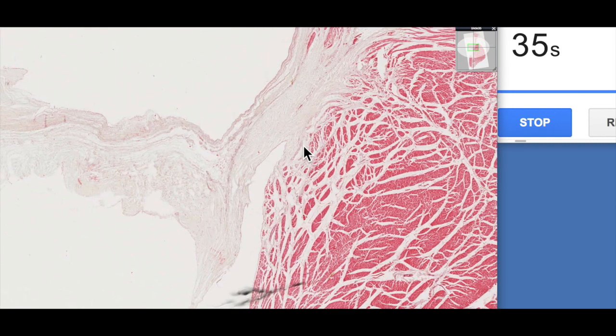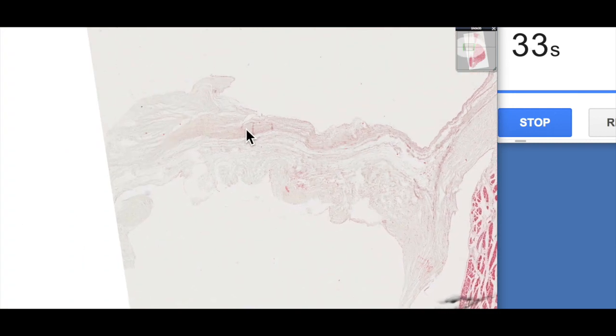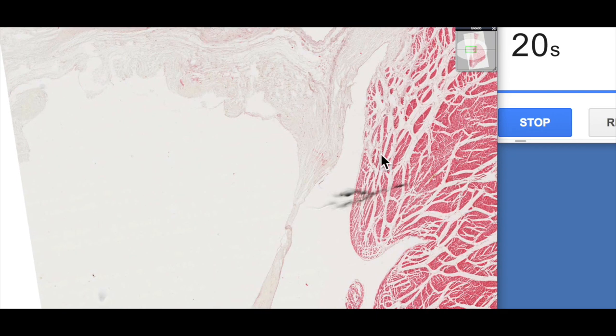So here again, as we mentioned, this is the atrioventricular valve. You can kind of think of it as an endocardial sandwich with the endocardium on this side, endocardium on the ventricular side, and then in between we've got the connective tissue, which forms an extension of the fibrous skeleton of the heart.